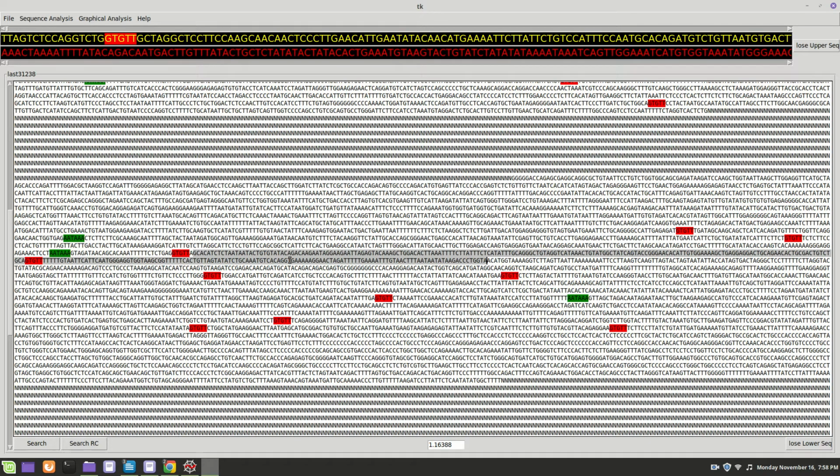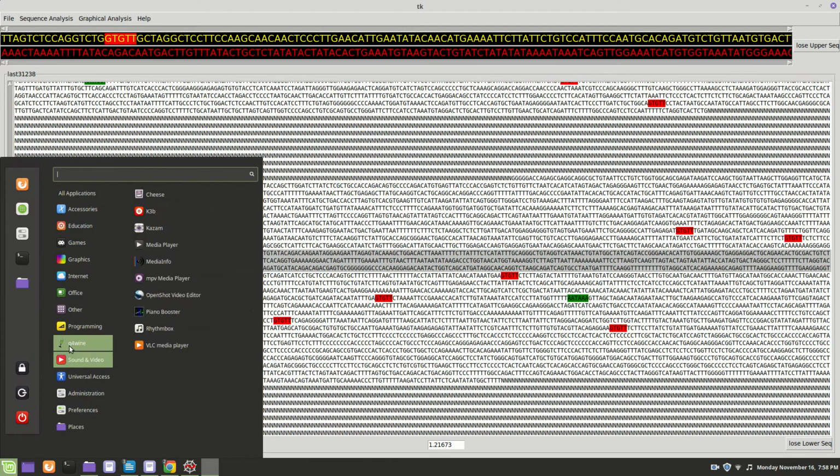I tell you what, why don't we go ahead and do it? I'm just going to see if it's close. It doesn't have to be super close, but usually it is. So I'm just going to grab these right down to here, and I'll copy, and let's take this piece and put it into Eugene. So I'll go ahead and do that real quick. I wasn't going to, but why not?